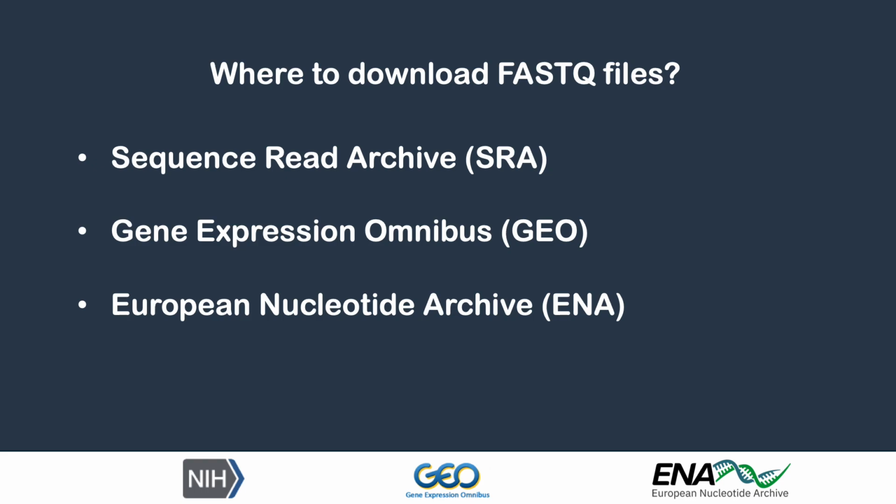We can download them for free from online databases like the Sequence Read Archive, people usually refer to this as the SRA, the Gene Expression Omnibus, GEO, and the European Nucleotide Archive, ENA, among many others. And the cool thing about these databases is that they contain real data from previously published experiments. So you can try things like reproducing the results, testing new hypotheses, or even conducting a meta-analysis.